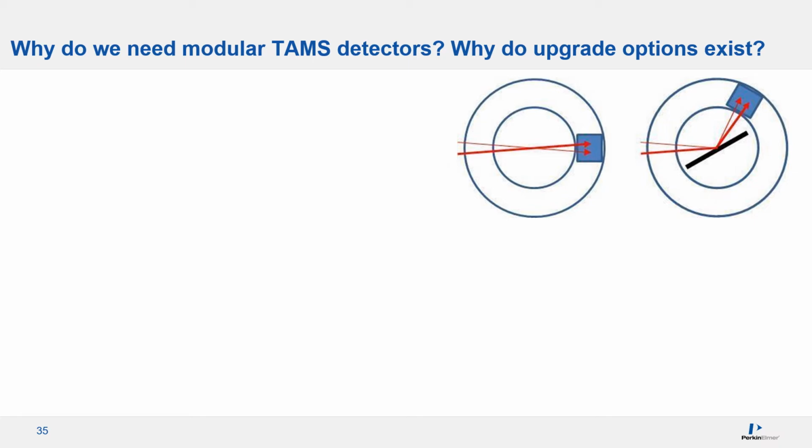And there's another factor. What if we are dealing with a thicker sample, typically glass, for which the additional secondary and tertiary reflections are considered to be a critical part of the measurement process?